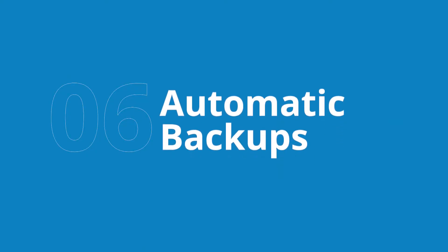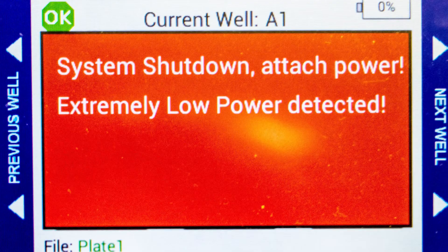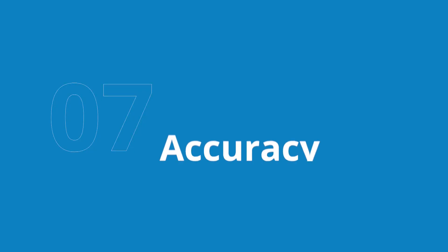Sixth, EVAM Manual prevents data loss with the autosave and data recovery features, which are critical when the battery is low. Seventh, EVAM Manual's low electrical noise design offers greater resolution and accuracy.